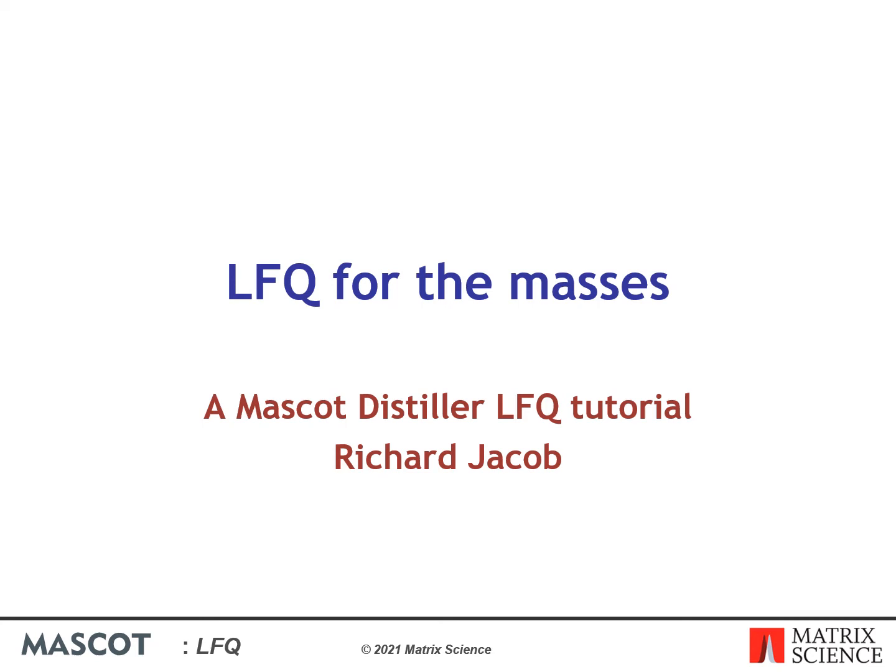Hello, this is Richard Jacob for Matrix Science, and my talk is LFQ for the masses. It's a Mascot Distiller label-free quantitation tutorial.